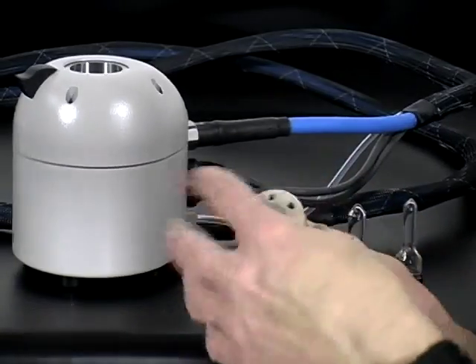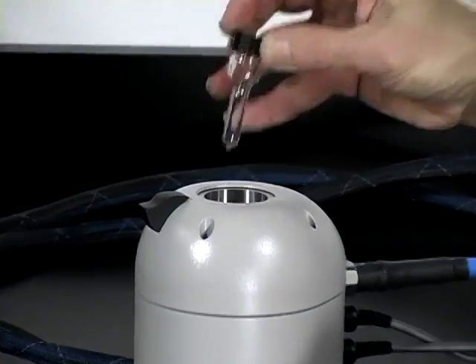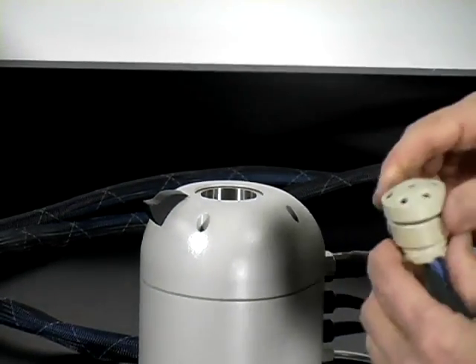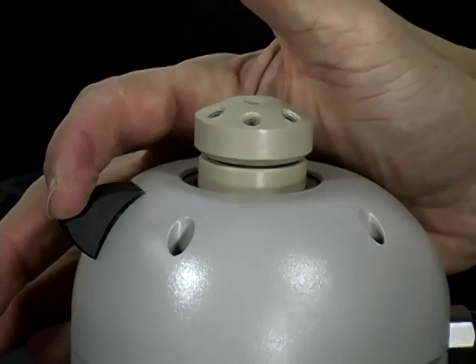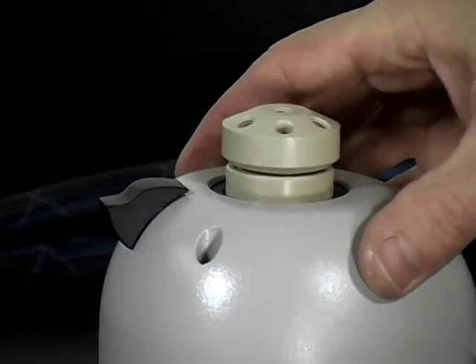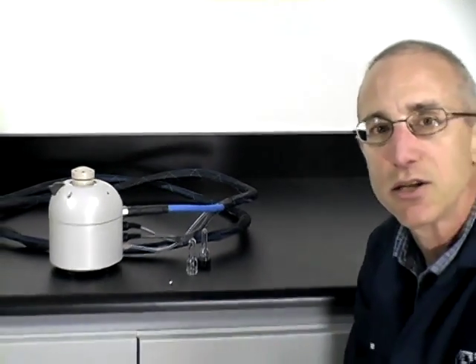I want to show one last thing — how the vessels fit inside the cavity. The 1 mL vessel with the screw cap just sits in and can be taken out. For the multi-port head, it will go in and there's a little retaining clip on the side. Press that down to remove the clip, and let it back in to hold the vessel head. That covers all the information about the CEM PetWave. Thank you for your time. If you have any further questions specific to applications or features not covered, please contact your area representative.